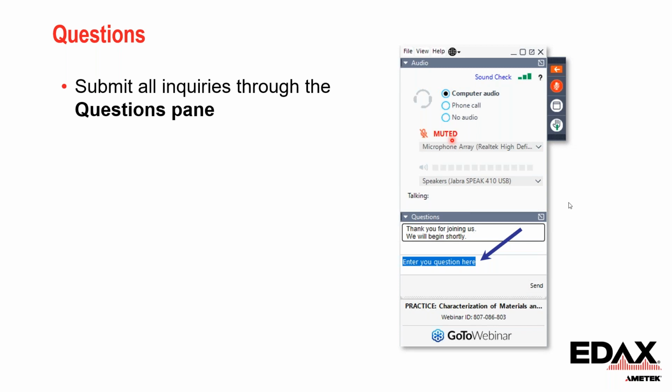Okay, I see there is a question. What allows you to carry out the best quantification with the WDS? This is a very good question. Let me start from the SEM side. First of all, you have to make sure your SEM has very good beam current stability.